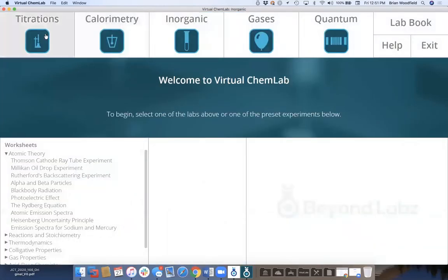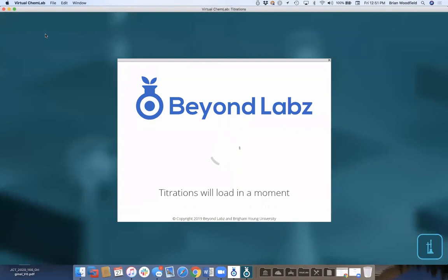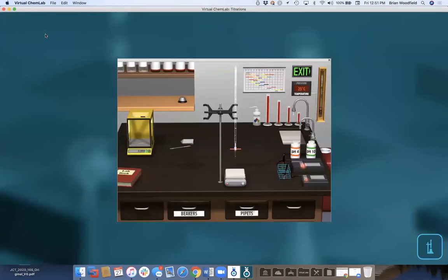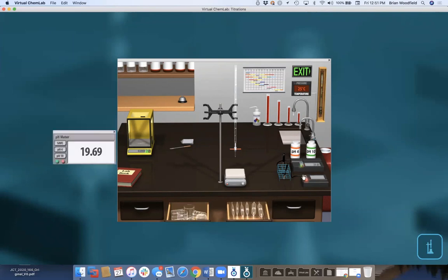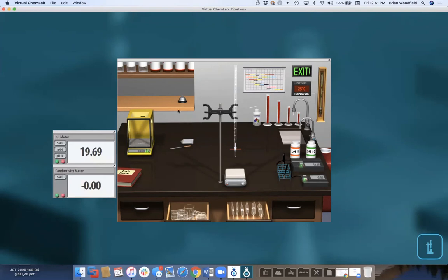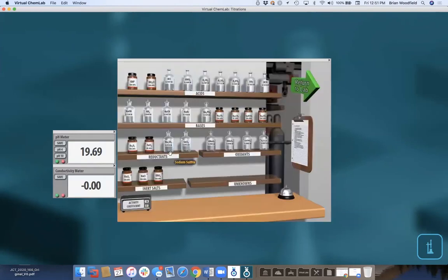Now let's move to the titration lab. Drawers are full of beakers, pipettes, and an analytical balance. There's your burette, a conductivity meter, a pH meter. You can do oxidation-reduction titrations or acid-base — titrate any acid with any base, any acid with any acid, any base with any base — and we'll calculate the pH. There are solids and solutions available.